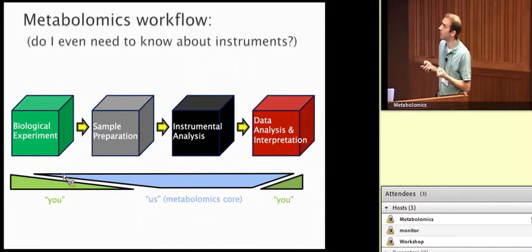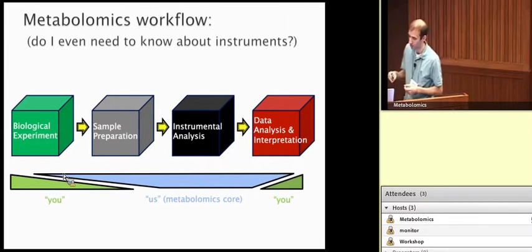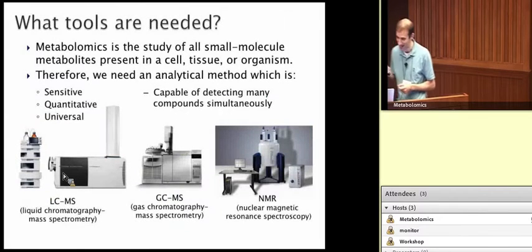Do I even need to know where we are in this queue? We're right here in the middle, in the proverbial black box. Yes, this is mainly done by the metabolomics core, but I've already told you why we want to know. So today, for the next few minutes, we'll open the black box, see what's inside, and then we can close it.